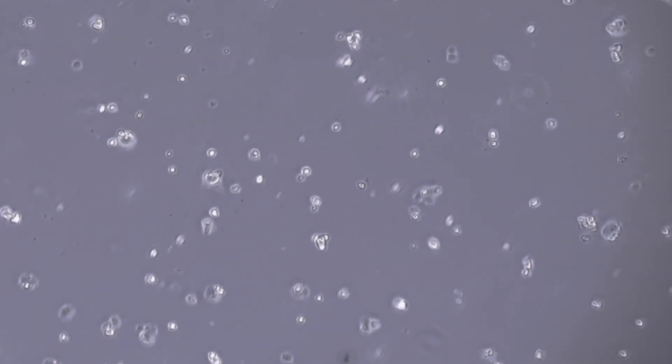This is an image of good quality plated cells right after plating. Ideally, cell clumps should be formed by around 10 to 50 cells.